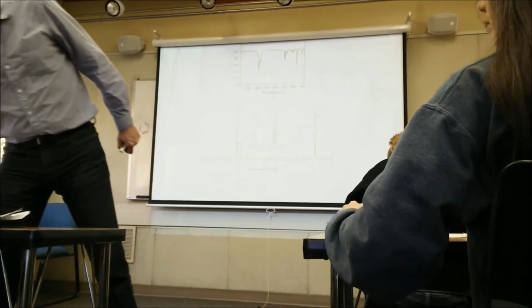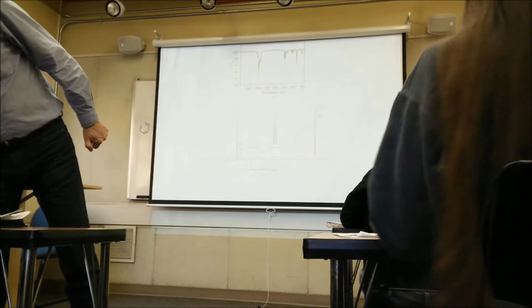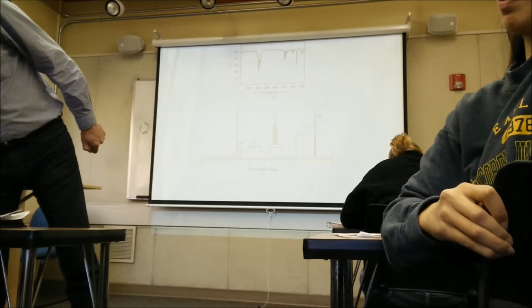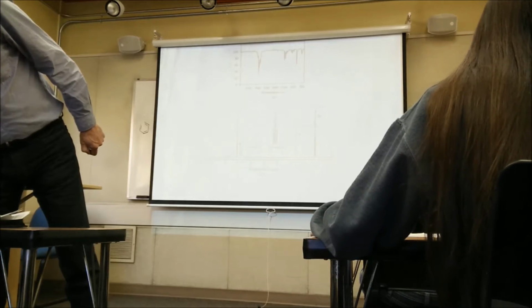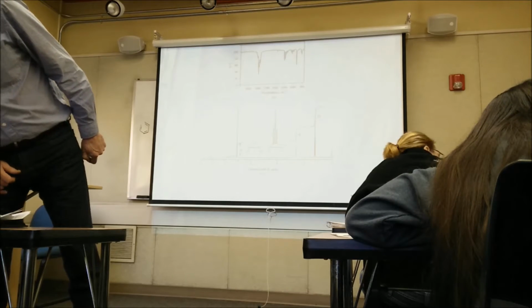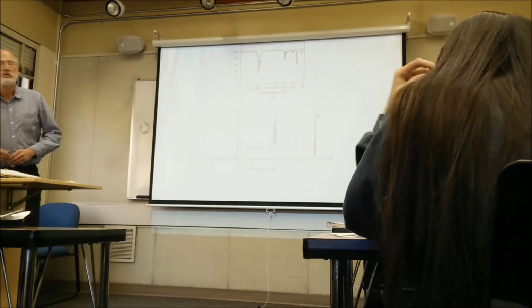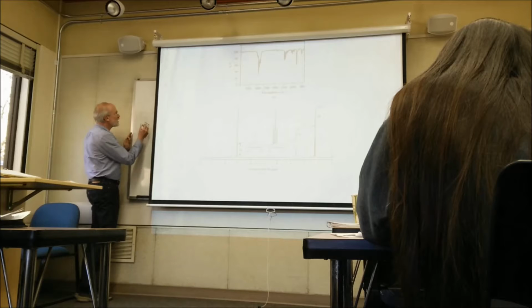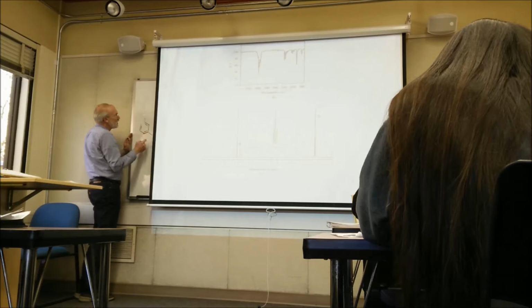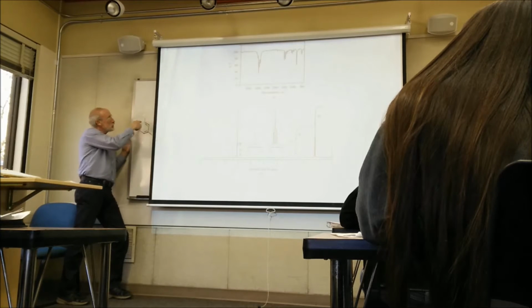So we're looking down here at aromatics, and we're looking for about an 800. 830 and 780 are right there. So that's meta or para. But meta would have 2 peaks. So this is probably para. Yeah, I'm going to guess para, because with meta, that proton on the ring would have a different chemical shift than these 3.